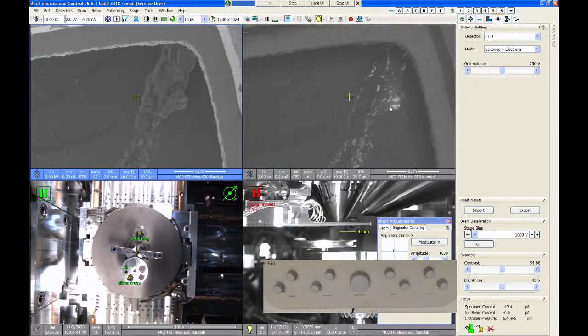But the nice thing is, and I'm not going to go through the EDS stuff today, the EDS detector controls are on the computer just next to me. So if I want to, I can just go over there, turn on that software, and put the electron beam right down on top of that stuff and have it scan right there. And I can record the spectrum on the EDS detector from that spot, and tell you exactly what that is. And that could be quantitative or qualitative, depending on what you do. And then you know what you're looking at.